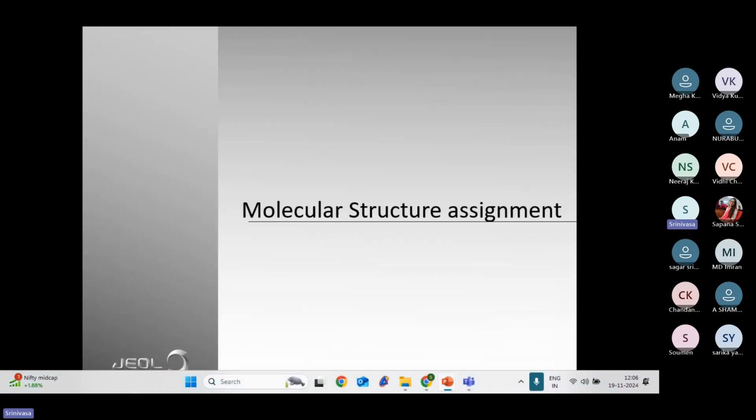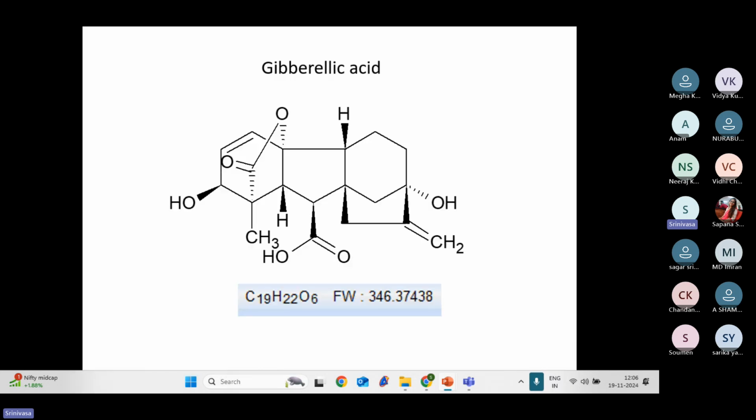Okay, now I have given the brief introduction about the 2D experimental side, and I have taken one example. I know you people are chemists, you already use an NMR spectrometer for your assignment purposes. I just want to glance at a simple example here. The example I have taken is the structural verification side. There are two different ways to use NMR spectroscopy. The one is structural elucidation, where you have an unknown molecule. You don't know the structure, so you have to use NMR spectroscopy. For that, you require different spectroscopy techniques and mass and everything for the structural elucidation.